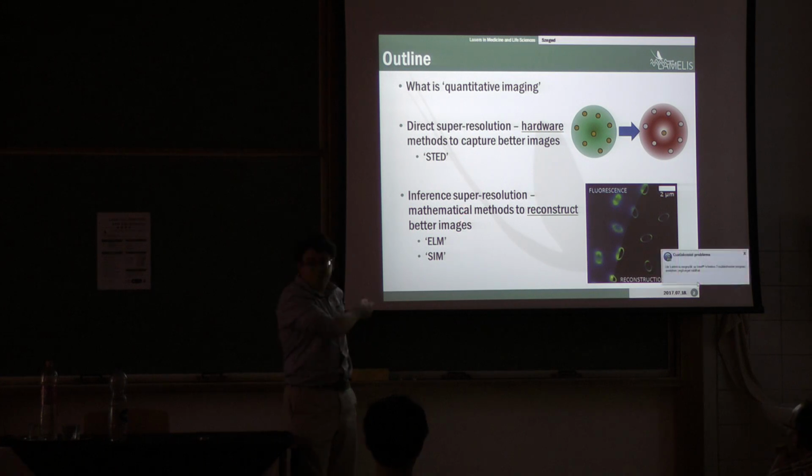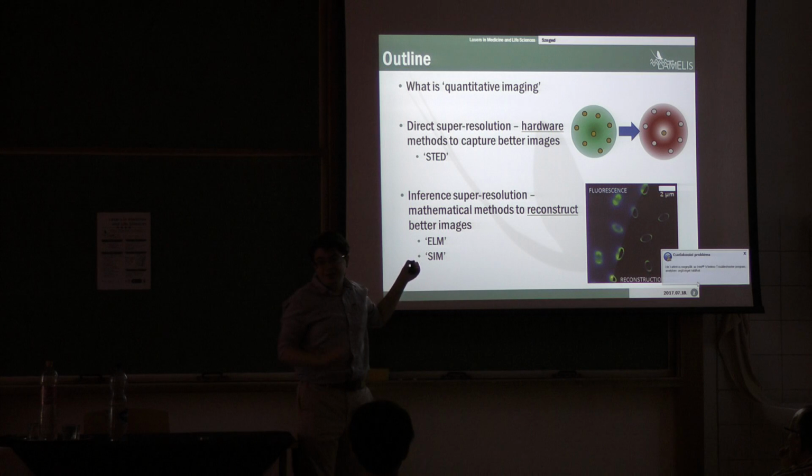And then I will talk about some of my research where we've used some super resolution microscopy to study antibiotic-resistant bacteria. I will talk about 2 or 3 different super resolution techniques. One of them will be STED. This is what I call a direct super resolution technique. Basically, if you set out to do STED, you're saying, well, I'm willing to spend a lot of money to build a better optical system which will take better image data directly. And that has some advantages. You can apply it to many different things.